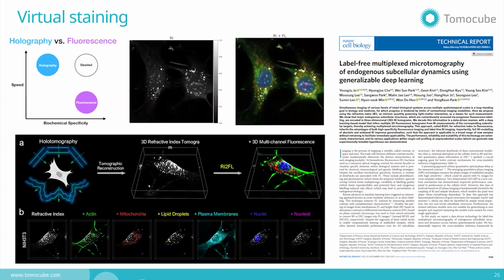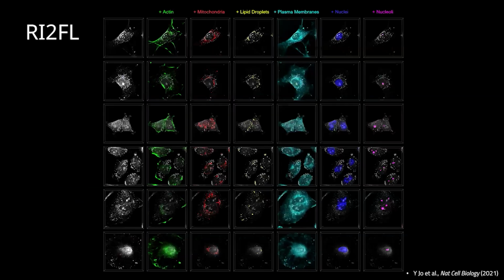So what we have done is we relied on the use of GAN networks. For training purposes, we fluorescently labeled the cell, and for the same cell we measured the HT data and then measured the 3D fluorescence, and we trained the AI networks on this paired data set. Once training is done, you don't need to label the cell anymore. By measuring the label-free holotomography images of the cell and clicking a button, you can generate the virtual 3D fluorescence. And accuracy was very high, greater than 97%.